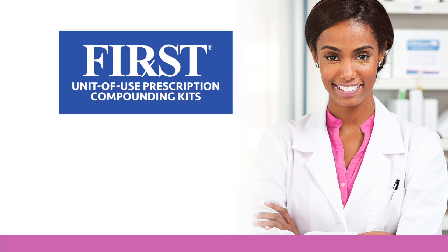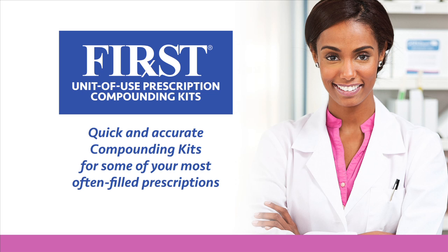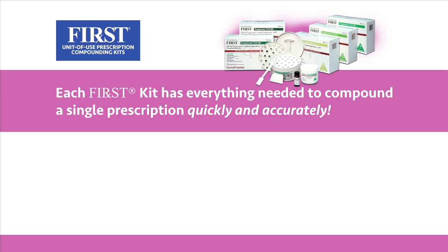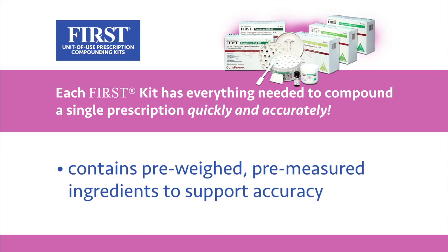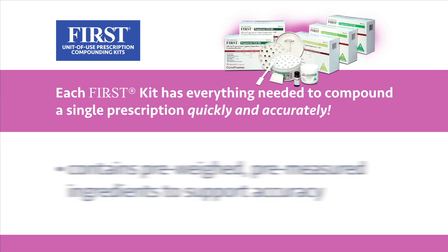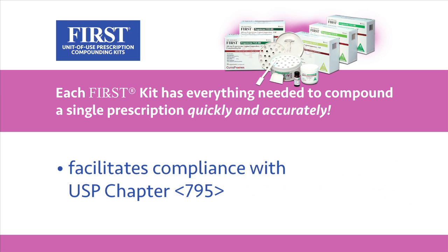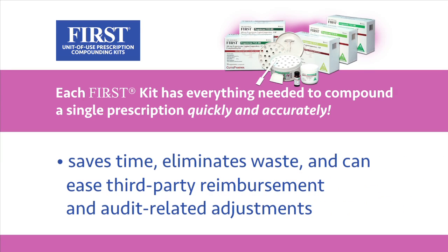First Unit of Use Compounding Kits — quick and accurate compounding kits for some of your most often filled prescriptions. Each First kit has everything needed to compound a single prescription quickly and accurately. Each kit contains pre-weighed, pre-measured ingredients to support accuracy, saves prep, compounding and cleanup time, facilitates compliance with USP Chapter 795, eliminates waste, and can ease third-party reimbursement and audit-related adjustments.